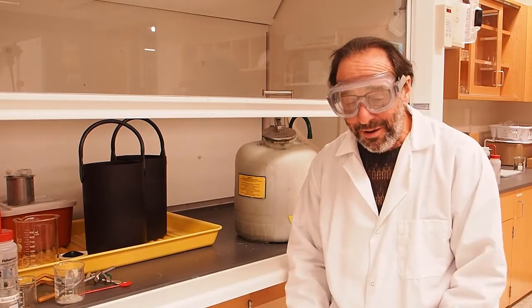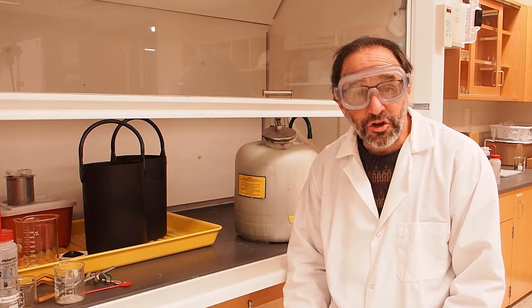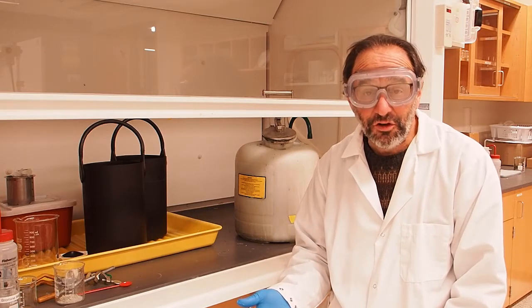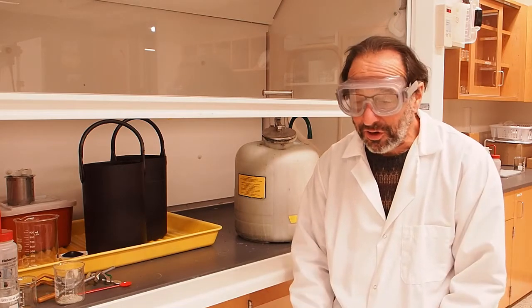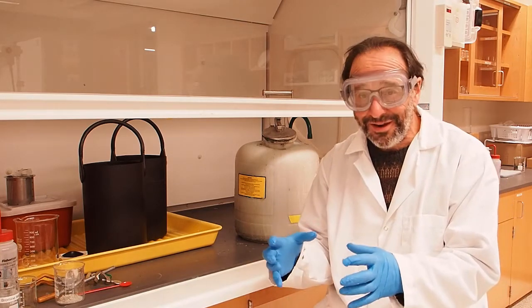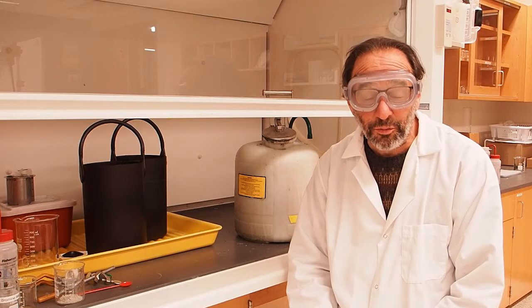Now let's talk about minimizing the exposure of the chemical compounds that we're using to the environment. We don't want to have the chemicals that we're using be leaked into the environment. The main way we do that is by collecting our chemical hazardous waste. There really are two kinds of those: liquids and solids. Solids will go into a container, kind of like a big mayonnaise jar that will be put out by your instructor, for you to put any solid waste that you have.